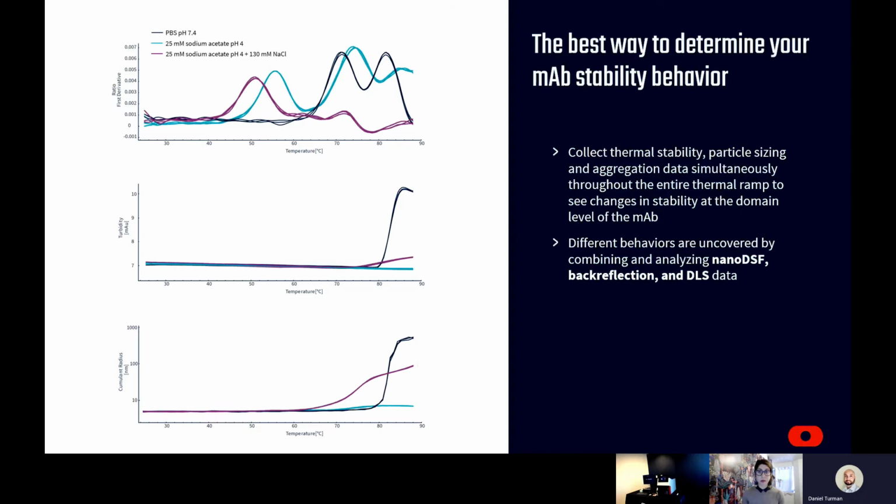In the sodium acetate buffer, we have in light blue, shown here, the unfolding transitions shift to lower temperatures, and we no longer have the formation of large aggregates in solution indicated here. The oligomerization occurring is very slight, and I can tell you from looking at this data more in detail, it's a marginal increase from about 5 to 6 nanometers in radius.